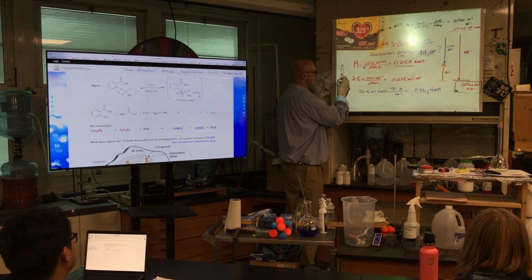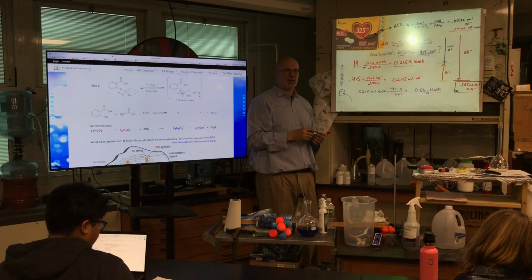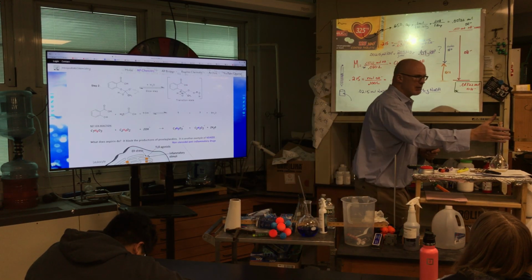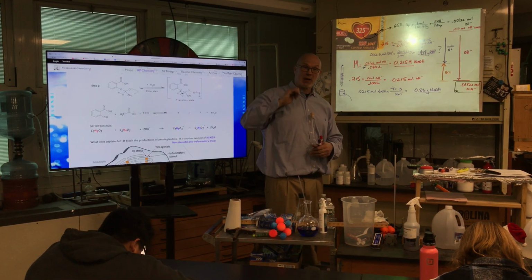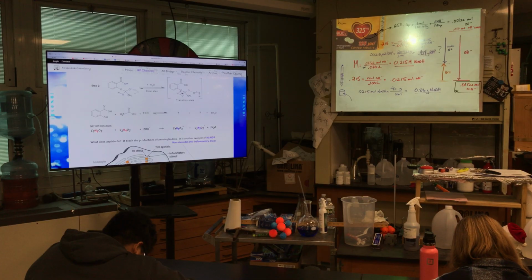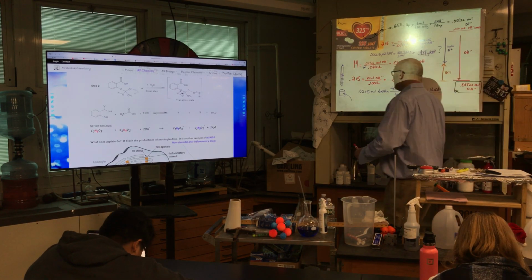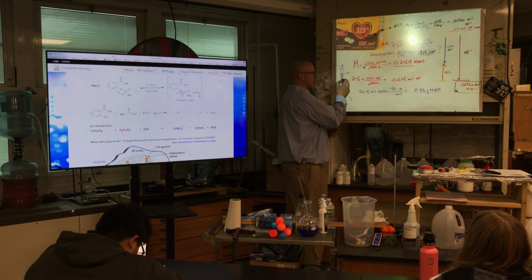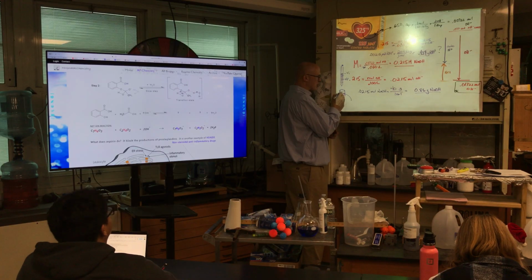And then my burette, I'm gonna add, I don't know, 15 out of the 20 extra. I'm gonna add phenolphthalein. It'll stay clear in the KHP, the acidic solution. And we're gonna titrate to an endpoint using the indicator, like you've done, very carefully. And when the color persists for 30 seconds, I'm gonna measure. This is gonna go down, here's my initial volume, here's my V final. I'm gonna subtract that once this color persists.